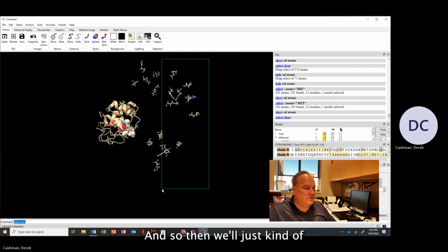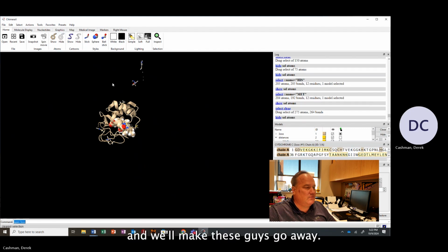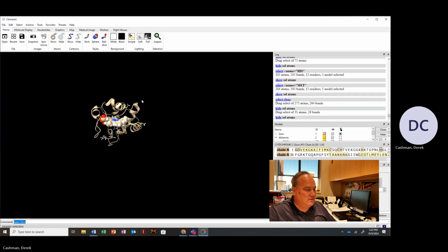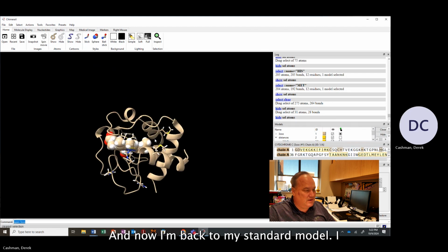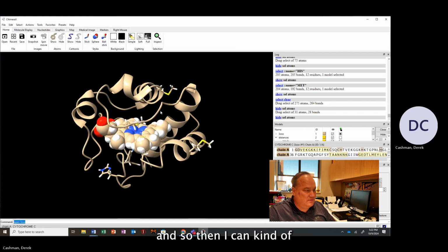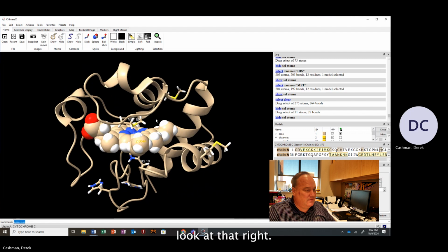And so then we'll just make these guys go away. And we'll make these guys go away. And now I'm back to my standard model, right? And so then I can look at that, right?